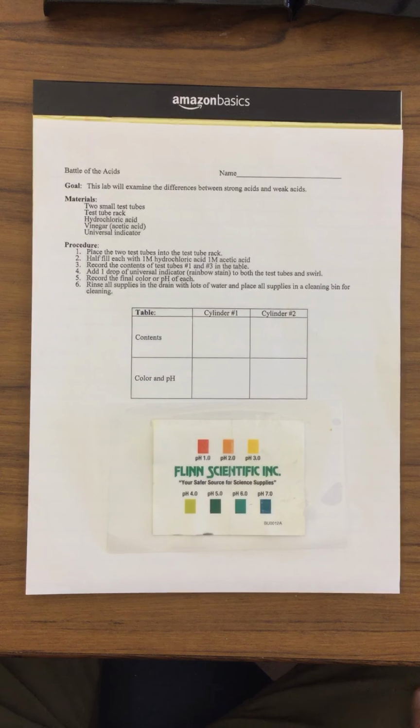So this is a little bit better than the litmus test. It's not just telling us whether it's an acid or a base, it actually tells us the strength of that acid. And the question is, why is it that strength? If you remember, pH is the potential to hold hydrogen. And the higher your pH, the better you're going to be able to hold the hydrogen. If you remember, acids like to give up their hydrogens.